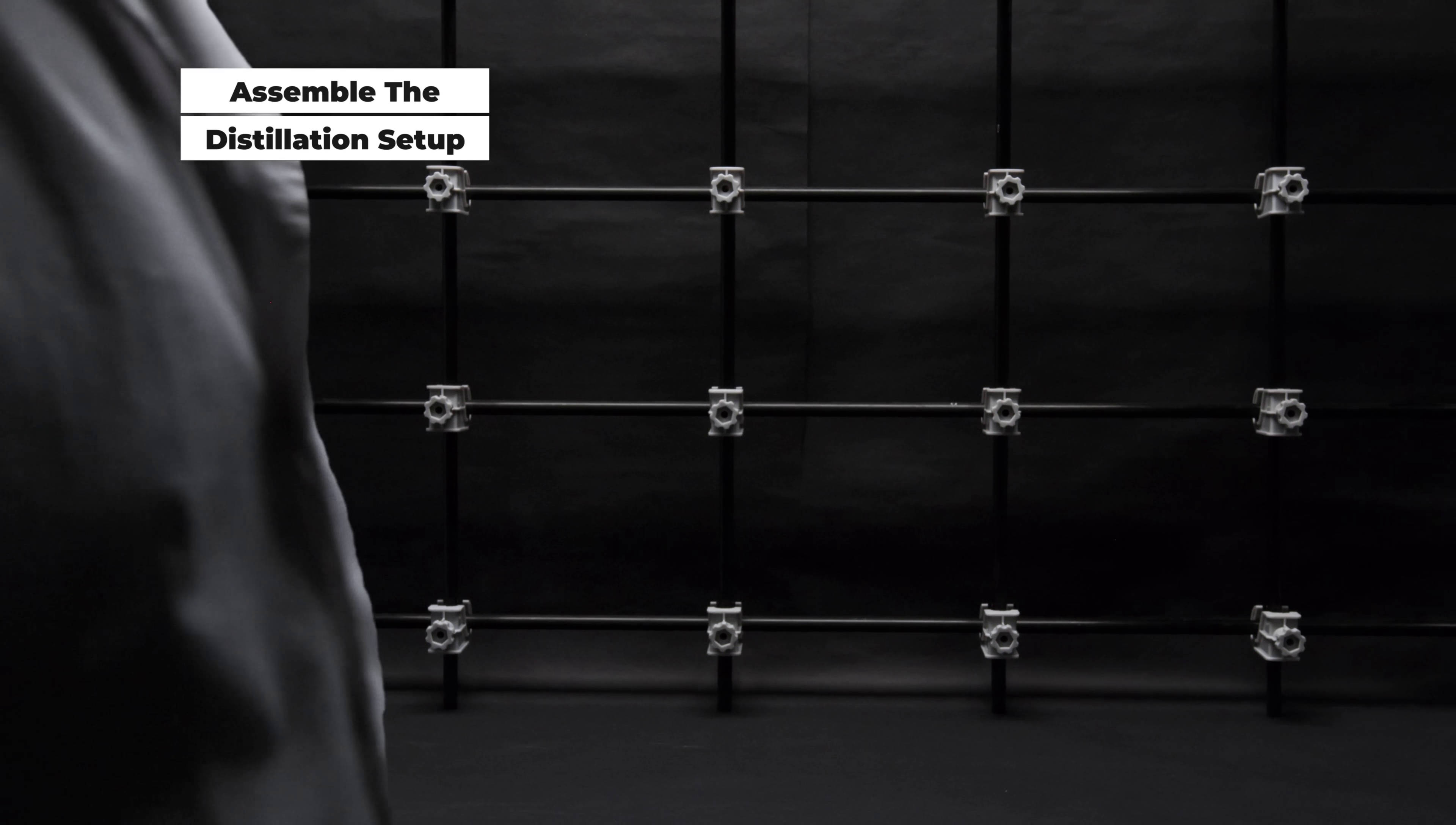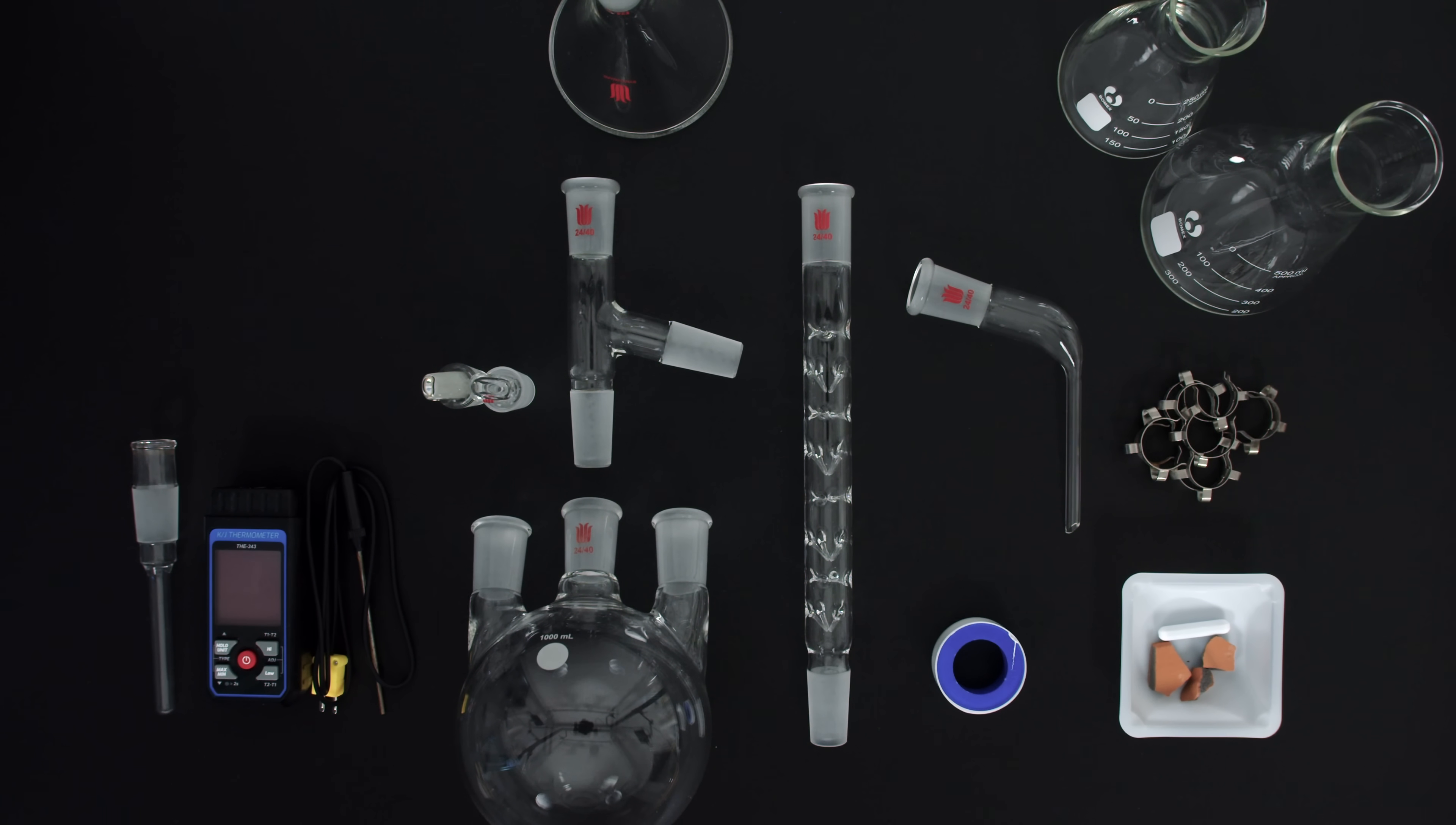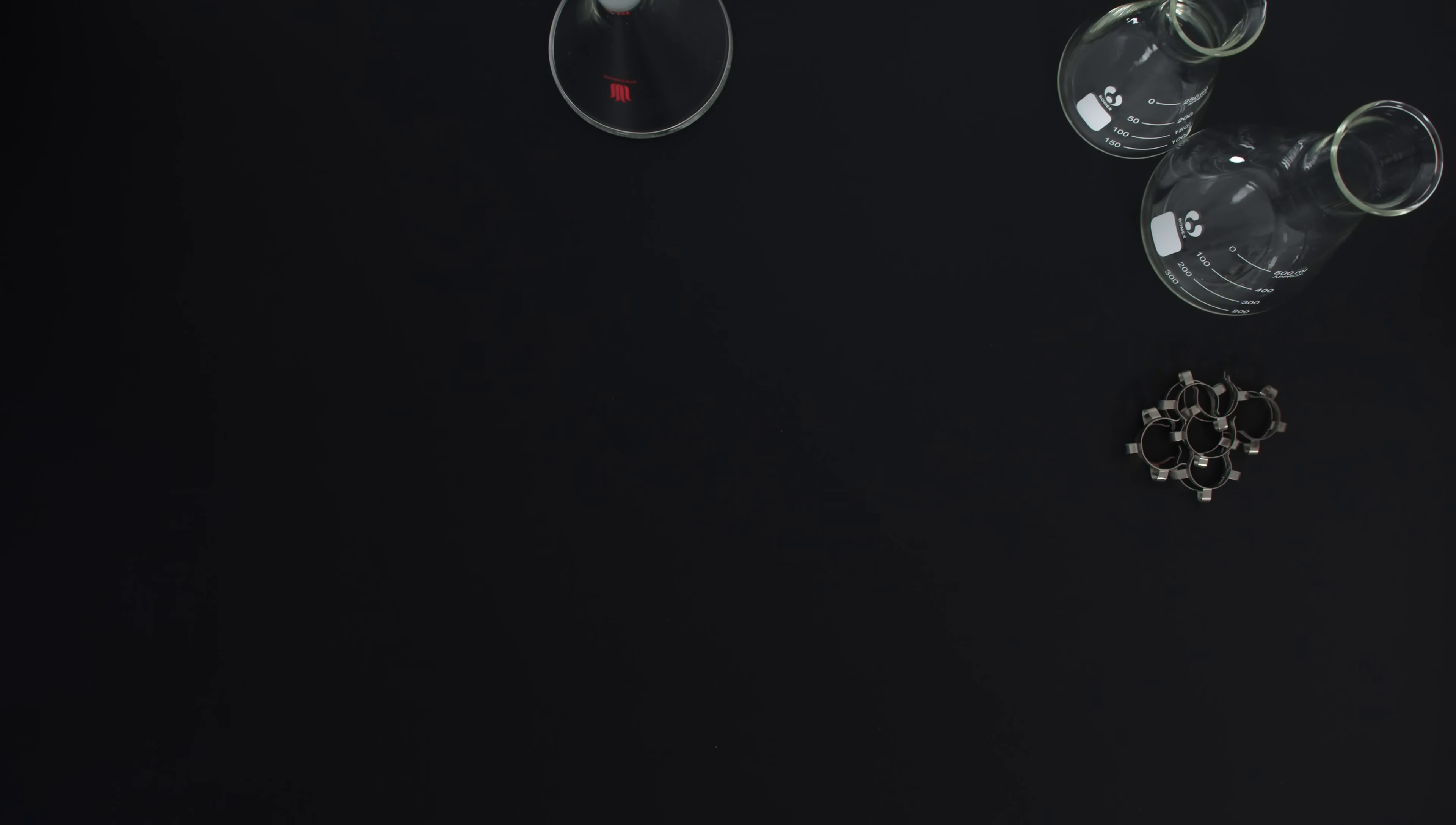Without further ado, let me walk you through the distillation setup for this experiment. In my setup, I am using a heating mantle that is capable of heating up to 380 degrees celsius, a 1.0L 3-neck round bottom flask, some glass stoppers, a standard distillation adapter, standard distillation receiver, a 200mm Vigreux column, glass jacket with thermocouple, some PTFE tape, and some broken clay pot pieces as boiling chip.